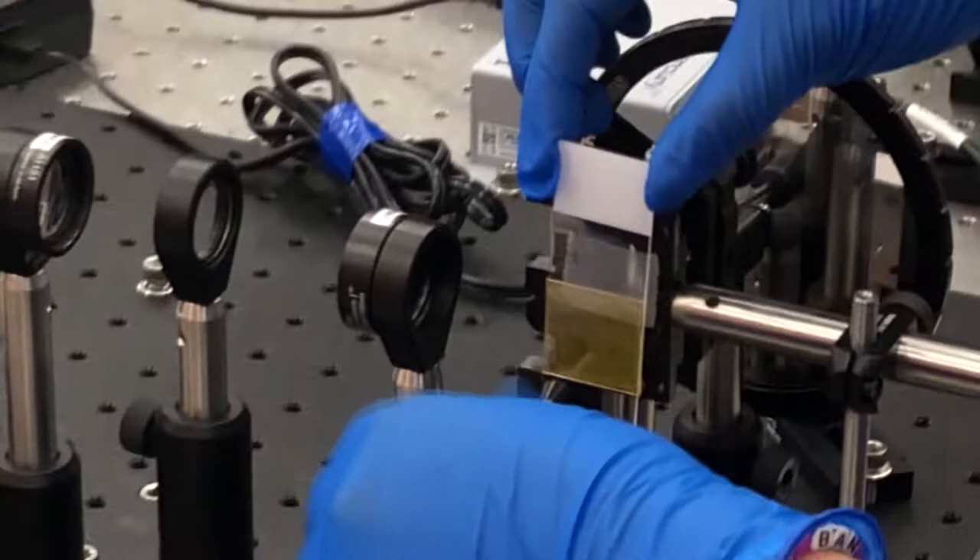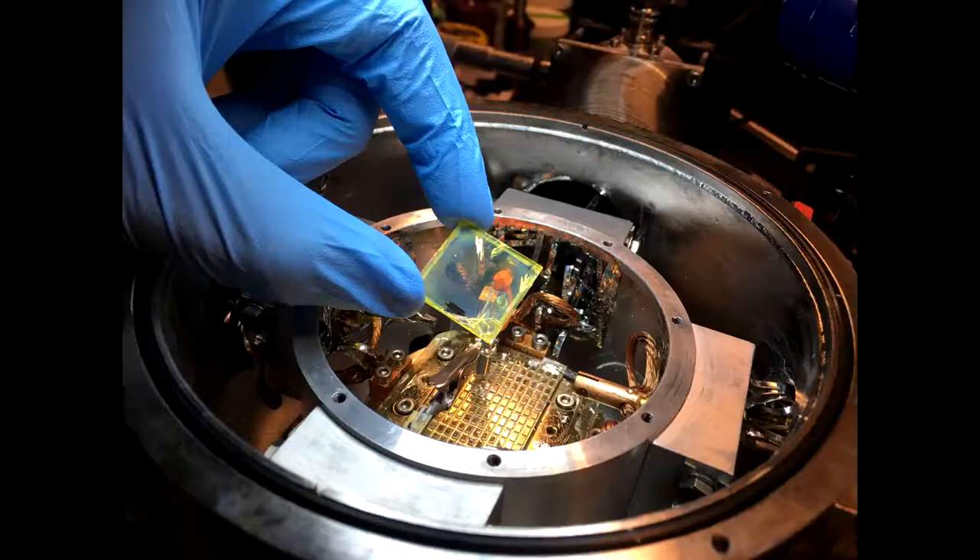We began testing after turning the lights off to better measure our samples for luminescence using a fiber optic. The light generated increased and decreased as the blade moved in steps during VSL testing, which allowed us to control the laser power on our sample.